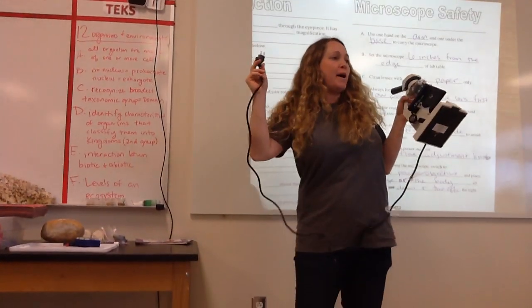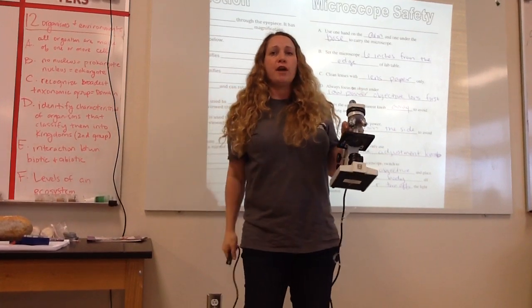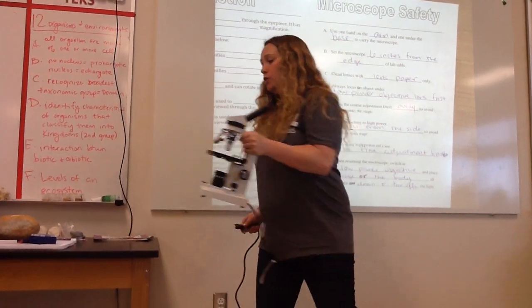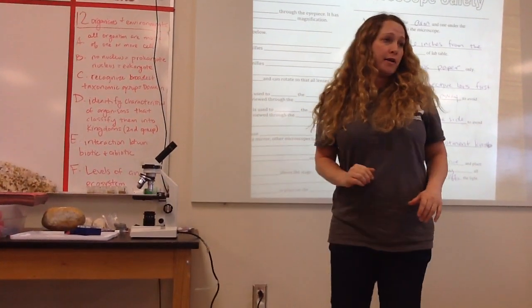Some of them use batteries, and some of them use plugs. The one I'm holding today obviously uses a plug, so you have to watch out for the cord. It gets tangled on something, and then you walk away, boom! Something really expensive is going to fall on the ground, okay? So be very careful. So I'm going to go ahead and set it down, and I'm going to plug it in. It has an on-off switch, so it's not going to turn on automatically, okay?